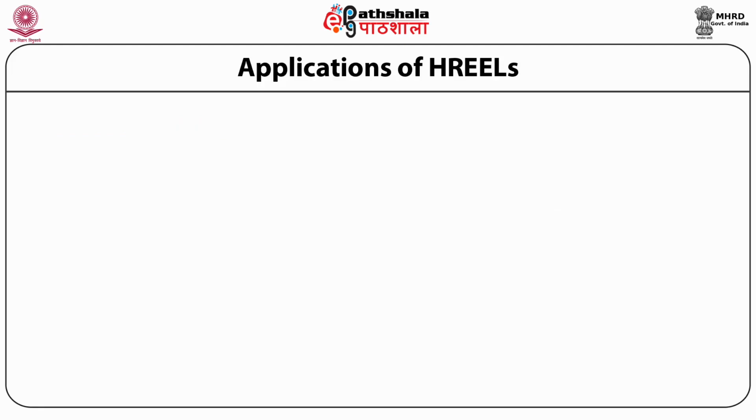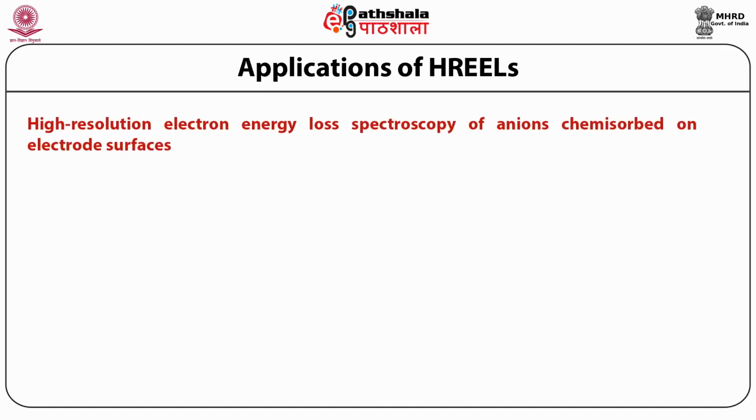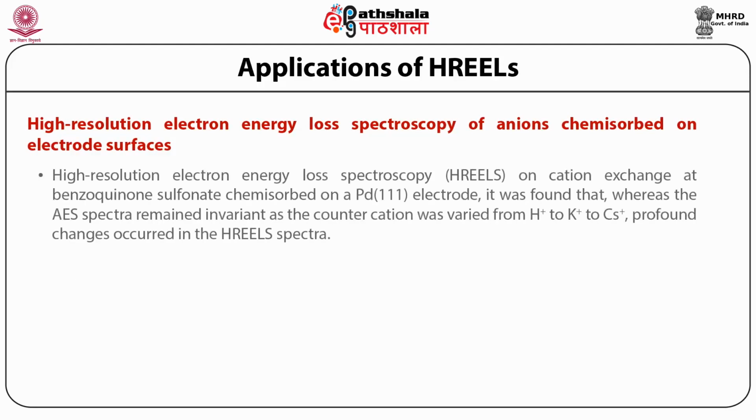A second application of HREELS: high resolution electron energy loss spectroscopy of anions chemisorbed on an electrode surface, on cation exchange at benzoquinone sulfonate chemisorbed on a Pd electrode.